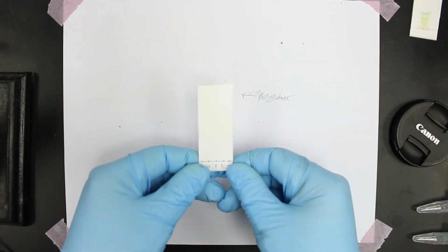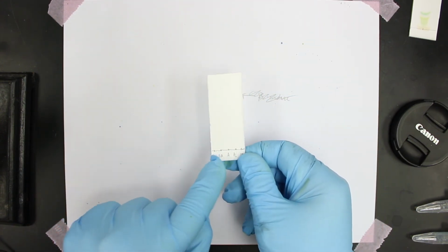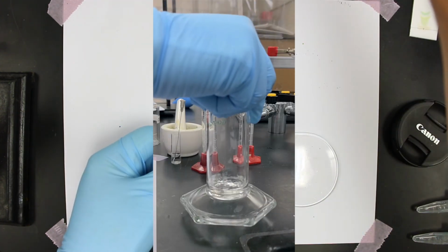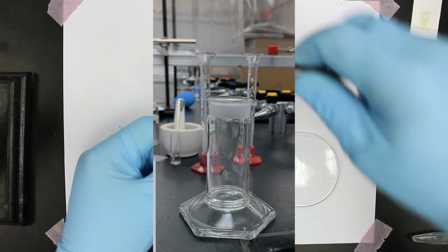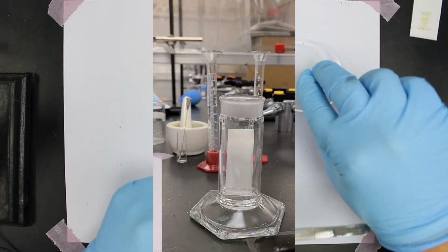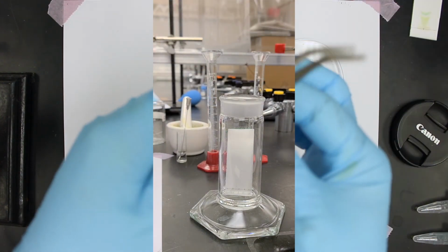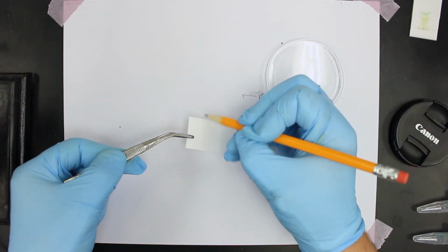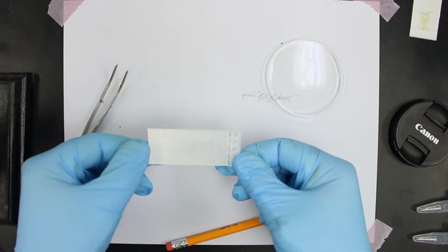Okay, so we've got our TLC plate, which has our 4 reference compounds and our unknown. And now we're going to put it into the chamber. Okay, so we're going to place it into our chamber with our tweezers, just as before. Alright, so our unknown TLC plate is done, so let's retrieve it from our chamber. Okay, mark the solvent front, and then we'll go look at it under the UV light.